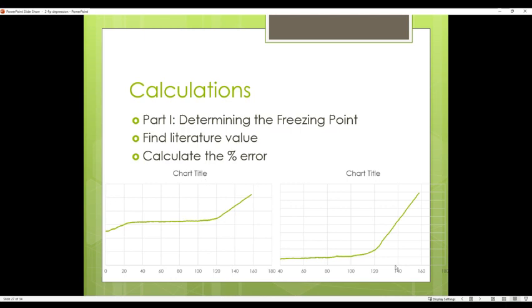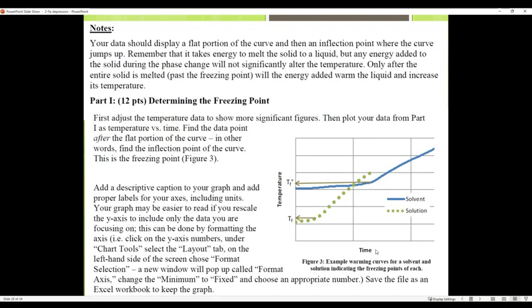All right. So here, I would just overlay a line on this by inserting the shape and see where those lines cross. If you really wanted to show off your mad Excel skills, you would actually do 3 plots in one: have one with the whole thing, one with just this portion of it that I would fit to a linear trend and let it extrapolate. Do the same thing with this linear portion and back extrapolate. And now you can clearly see where those two lines cross. Rarely people do it, but sometimes they do.